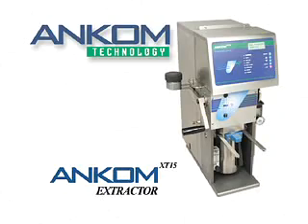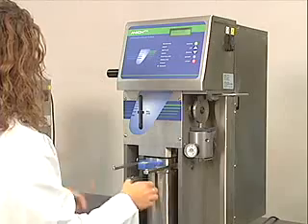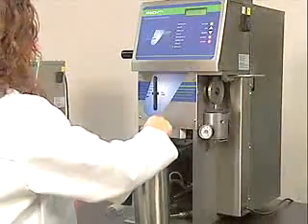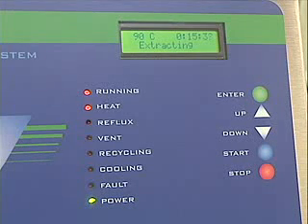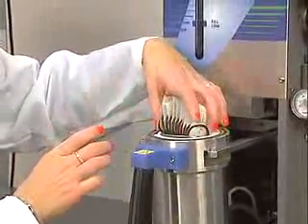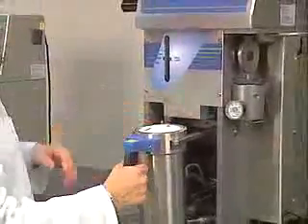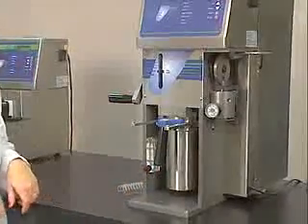Introducing the ANCOM XT15 extractor. The ANCOM XT15 provides a rapid, high-volume primary method for crude and total fat determination. Increased kinetics caused by higher temperatures reduce extraction time significantly, and proprietary filter bag technology allows for the batch processing of up to 15 samples at one time. The ANCOM XT15 is capable of as many as 150 extractions per day.